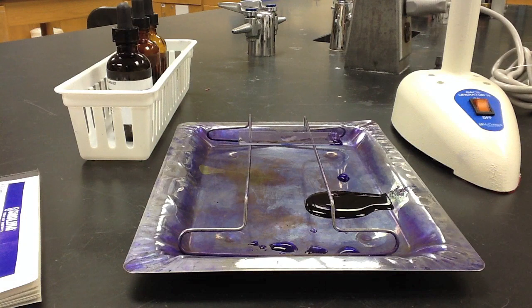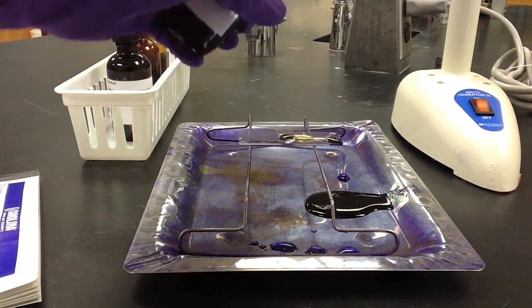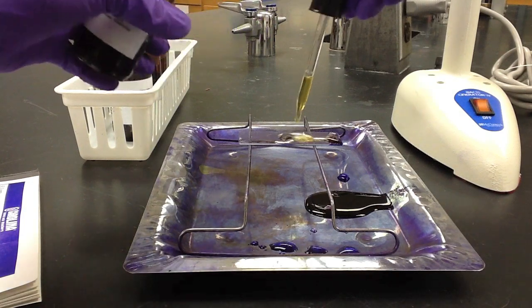Once we've rinsed off all of the crystal violet, we then add Gram's iodine to the surface of the slide. Once we've fully covered the sample, we'll let the slide incubate at room temperature for one minute.